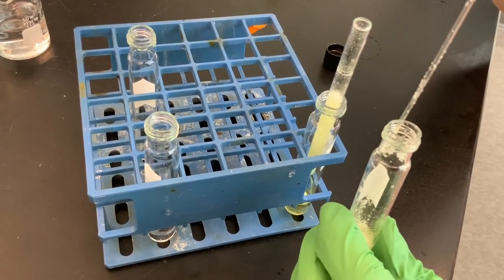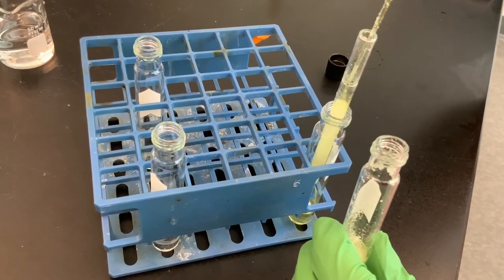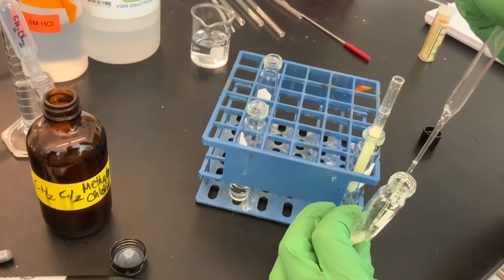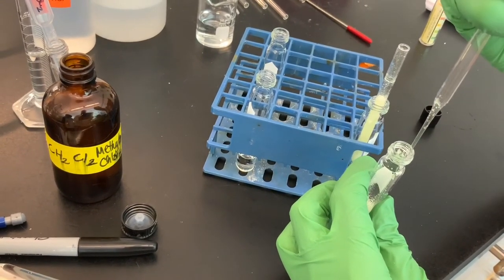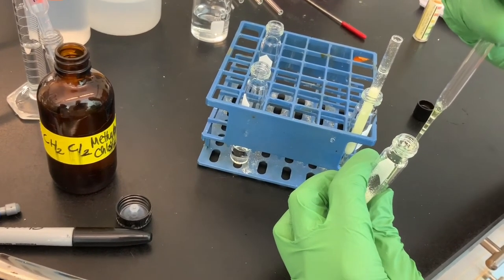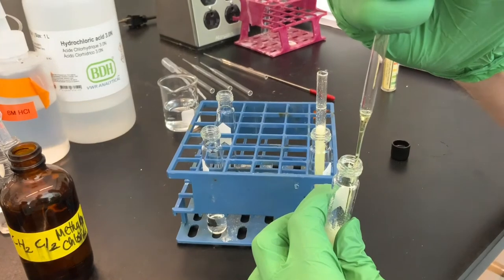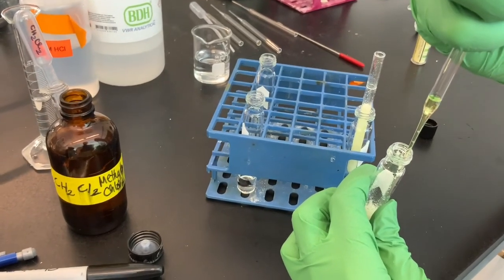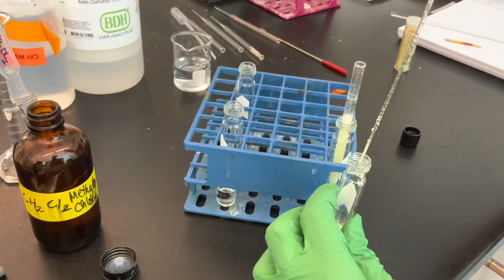At this point, we're just trying to get the last bit of flavor out of the snow cone, so to speak. But we still see that the sodium sulfate is yellow, so we're going to rinse it with fresh methylene chloride. But that's as best as I can do in terms of the first amount coming up. All right, here's a little bit more. Slowly. We don't want to have too much solvent to then have to evaporate off. Also, we don't want to exceed the volume of the culture tube.